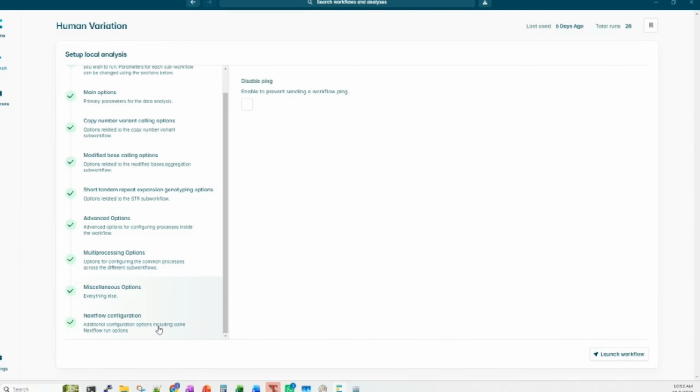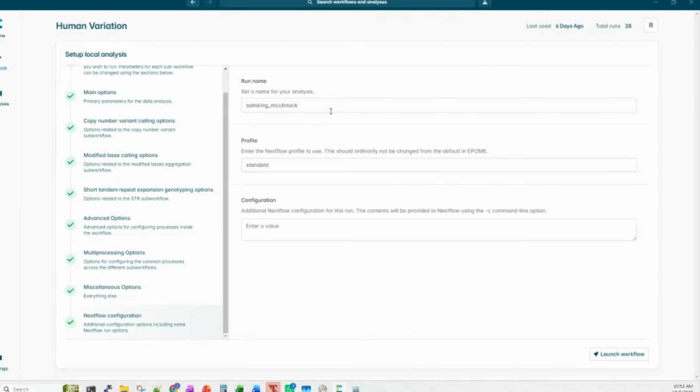Other than that, I think I'm going to skip this. Yeah. Last part will be the run name. So by default, EPI2ME will assign a name to every run in the EPI2ME. By default, it's going to be some random words. So if we want to make it more readable for ourselves, we can also give a name for the analysis run. So for example, I'm going to name this as demo on 18 June.